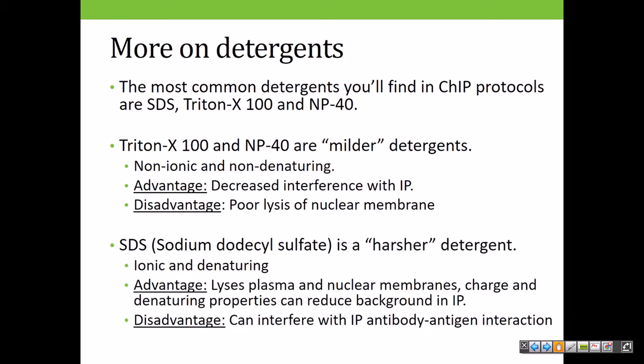So the protocol that I use actually does use SDS. I just work around it by diluting it later. SDS is a harsher detergent because it's ionic and it's denaturing. It doesn't discriminate between membranes. It'll lyse plasma, it'll lyse nuclear, it'll lyse everything. And so the advantage is that it can lyse the nuclear membrane very well. Its charged and denaturing properties can actually help reduce background binding to the column and knock off any carriers that are bound to the protein bound to your DNA. The disadvantage is that it can and will interfere with the non-covalent interactions between your antibody and antigen. So it's something to keep in mind when you're working with SDS.